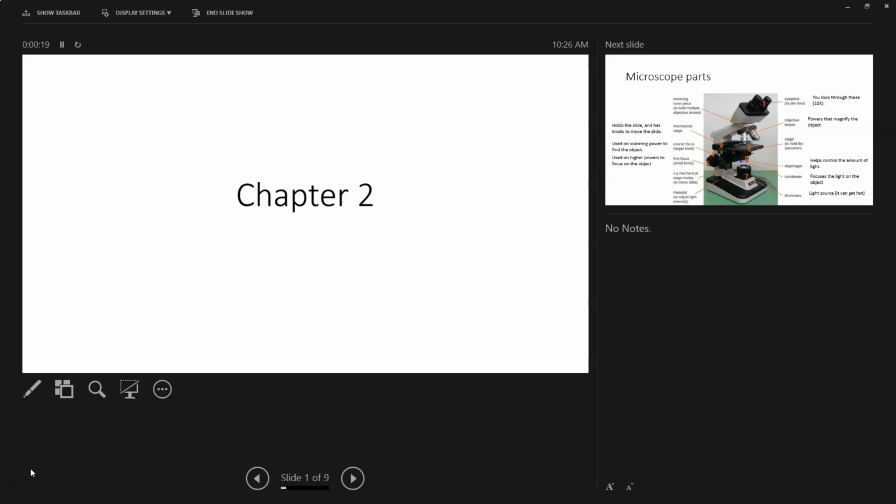A lot of chapter 2 starts to talk about light and the properties of light, and I'm going to link you guys to a video that'll help you understand that a little bit better from a physics perspective. What I'm going to primarily focus on here in this video is the relevance of that light, which comes back to microscopes, and so we're going to talk primarily about microscopes.